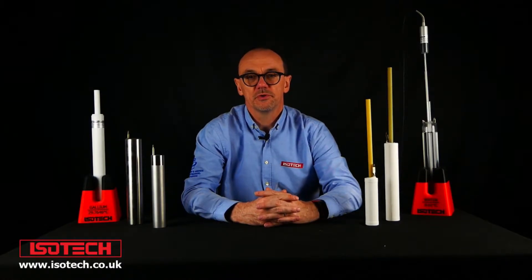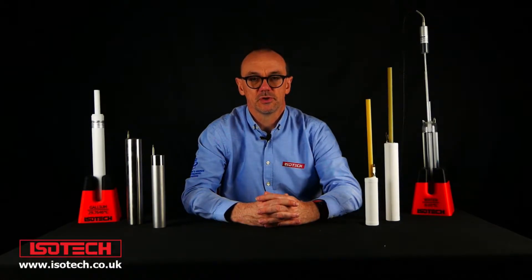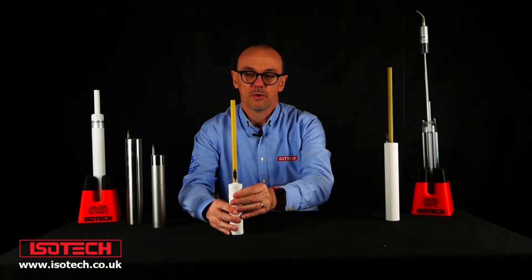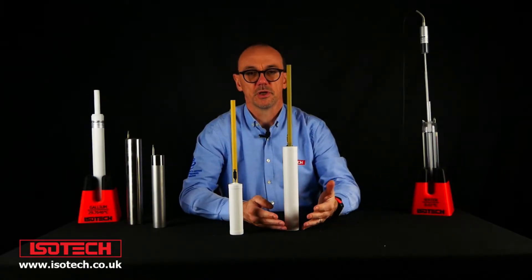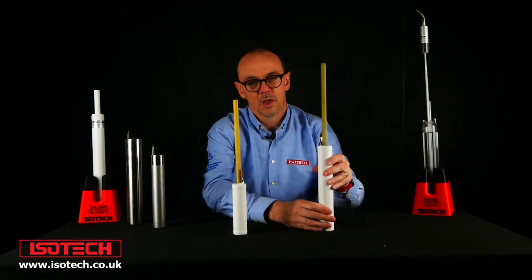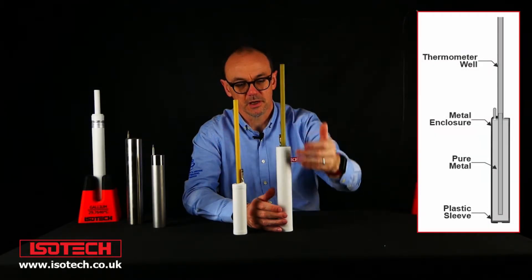Welcome to another introductory video relating to practical aspects of temperature metrology. In this session we're going to look at the mercury fixed-point cell. We have two mercury cells here: a small mercury cell, which like the other cells is good for shorter, smaller thermometers, and a larger mercury cell which is optimized for long-stem standard platinum resistance thermometers. We have the thermometer well where the thermometer, usually an SPRT, will come into the sealed cell.